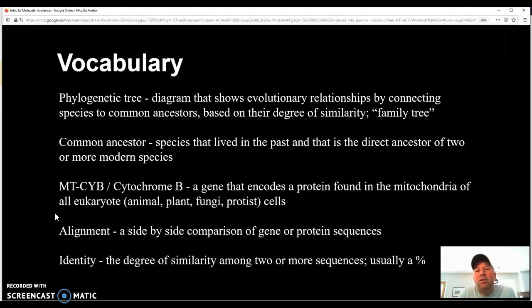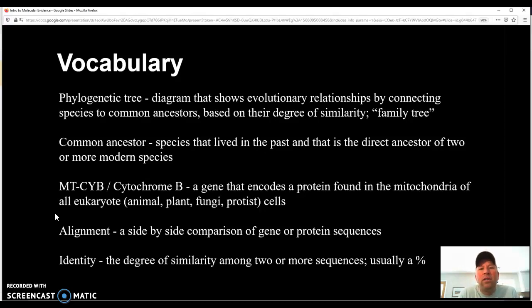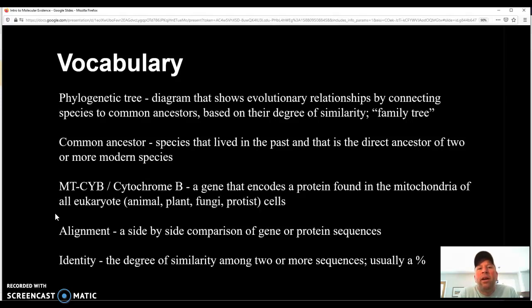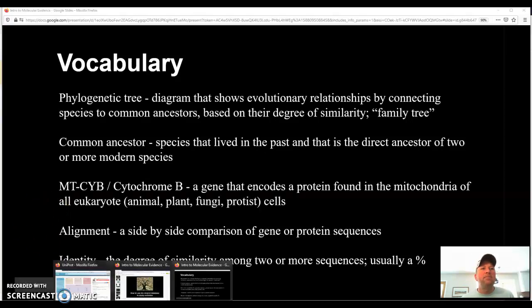Alignment is the term that we use for that side-by-side comparison of the sequences. So the program will line up the cytochrome B sequences for all the species you choose, and then it will calculate an identity. So identity is the degree of similarity, and it's expressed as a percent. So it'll say for all the species we're looking at, what percent similarity do they have? And from that, we infer their evolutionary relationships with organisms that have a higher degree of similarity being more closely related than ones with a lower degree of similarity. So let's take a look at the database.